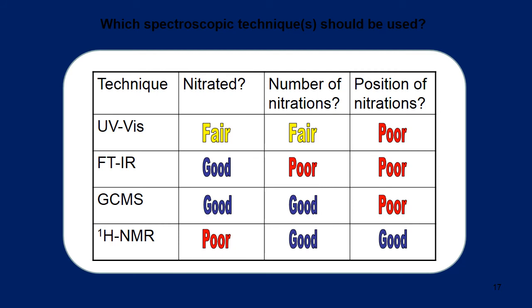The point here being that there is no single magic bullet. There is no perfect technique which will always tell you everything you need to know. And this week is a great example of that. We're going to have to combine FTIR and proton NMR analysis in order to complete our story.